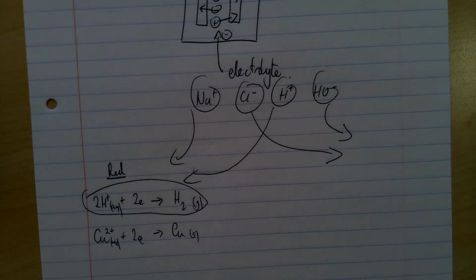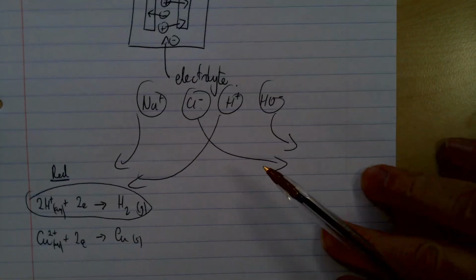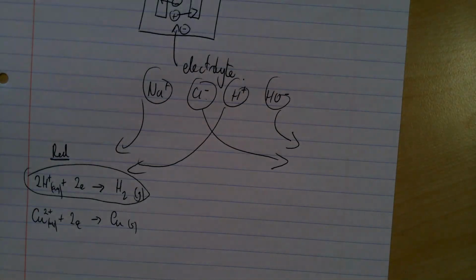So for some of you just pointed straight down thinking about it, of course it's going to become less acidic, more alkaline, right? But think about the copper solution as well. We know, don't we, triple students especially, that copper ions are coloured. So copper compounds, any transition metal compounds are coloured, we learned in triple. And so if the copper ions are being turned into copper metal, which we know is copper coloured, what will happen to the colour of the solution? Tell each other. More blue, less blue, or stay the same? Yeah, the colour will fade. What happens at the other electrode?